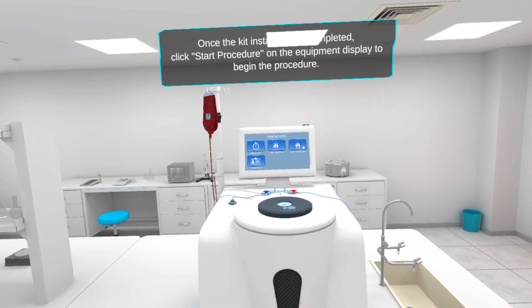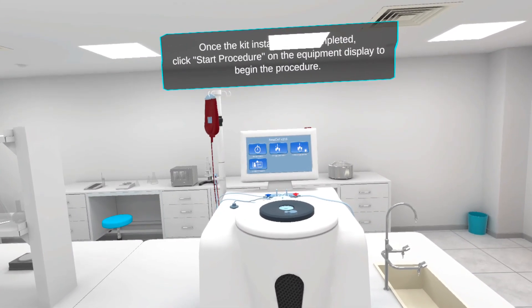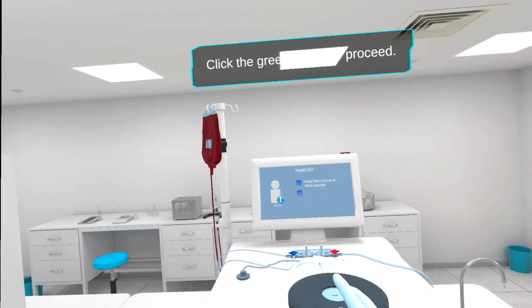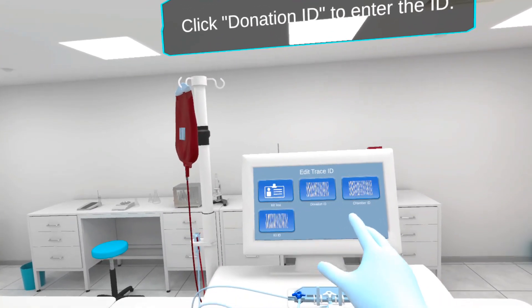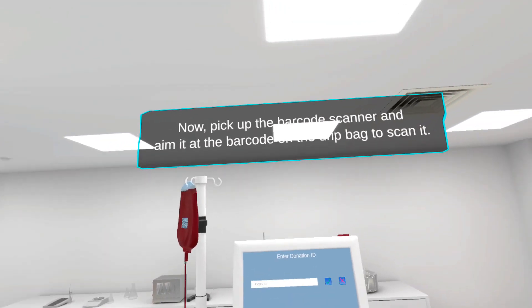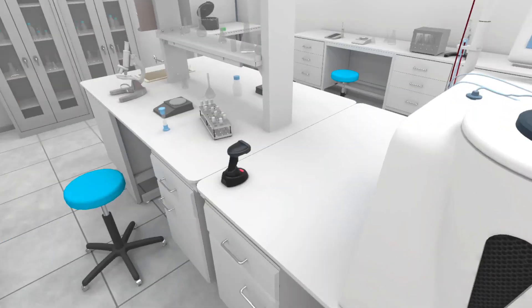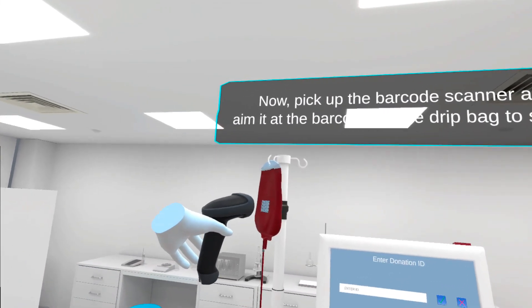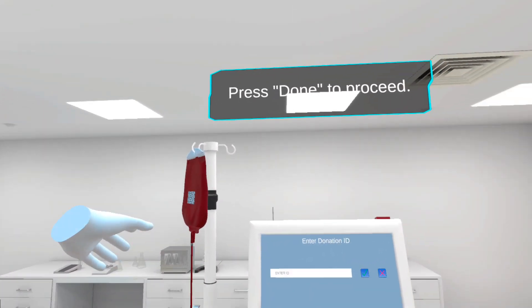Verify the overall status ensuring there are no kinks or twists visible. Once the kit installation is completed, click start procedure on the equipment display to begin the procedure. Click the green button to proceed. Click donation ID to enter the ID. Now, pick up the barcode scanner and aim it at the barcode on the drip bag to scan it. Press done to proceed.